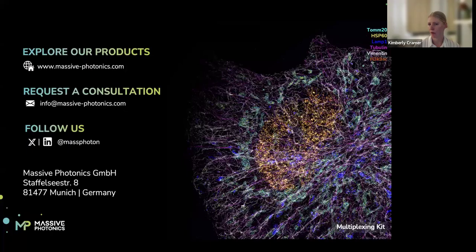People have been trying to look at cell surface receptors using live cell DNA paint. But in general, we wouldn't recommend this because you are using short DNA strands. So you're using DNA oligos, which could cause some sort of immune reaction in the cell. So yeah, if you want to combine it with live cell imaging, we would recommend doing your live cell imaging on the microscope using something like a Halo tag or a GFP to track your protein of interest, and then you can fix the sample on the microscope after you have your live cell data, and then do the super resolution imaging.